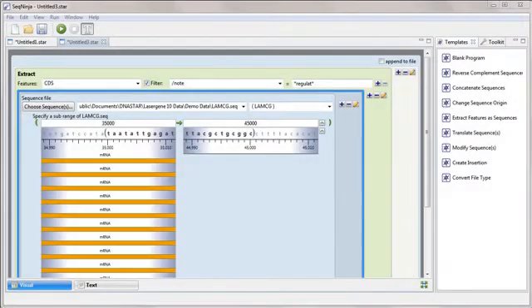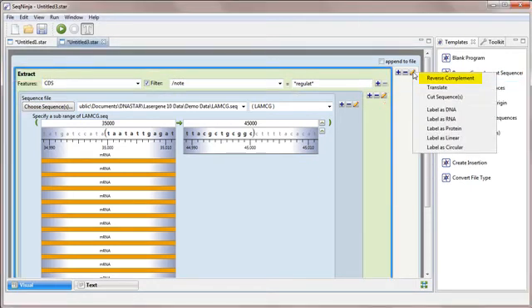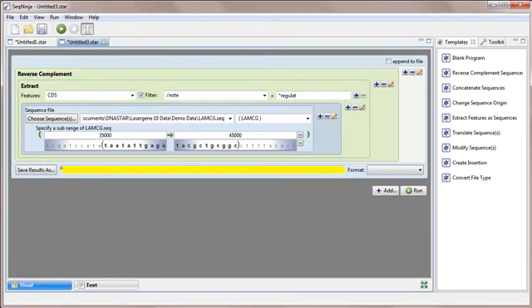To add the reverse complement step, I'll click the Edit icon to the right of the Extract step and choose Reverse Complement from the list. Note that when I added this step, the subrange features display closed automatically to conserve space in the view.